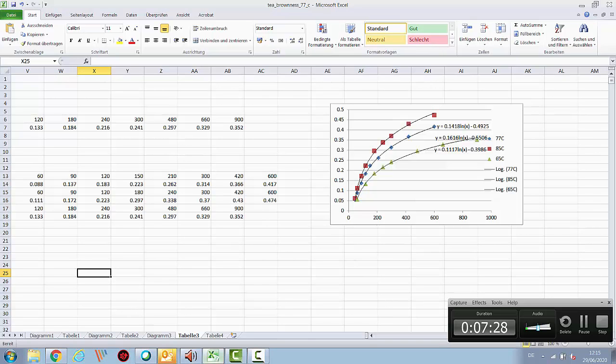So what I've done is I've measured the brownness, because I knew that it would oxidize and go darker over time, and that would be very difficult then to correlate back to the brownness ratio. So I've just measured them very quickly so that we've got that data. Then I'm going to extract the caffeine from the samples and try to get the same type of curves for caffeine amount. We will also have to do a reference using some caffeine, and then we will be able to write it up, which is the job that I'm giving to you for this course.